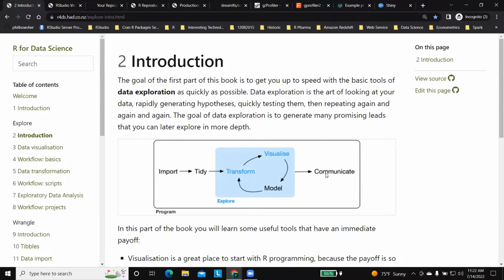And so what I'm going to show today is how you can do this within the DNAnexus platform, and how you can do this on the Biobank data right inside of RStudio. For those of you that aren't familiar, RStudio is an IDE, which stands for Integrated Development Environment. It's basically the place where you do your analysis and your work and build those workflows that you're going to use on the genomic data that you have.